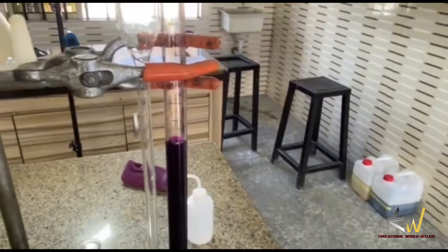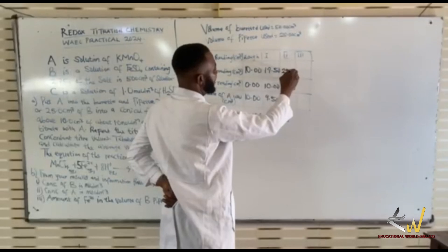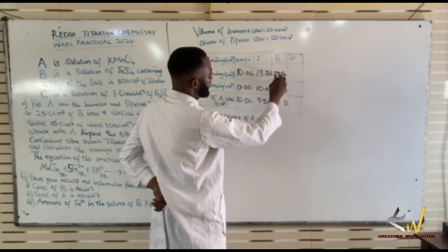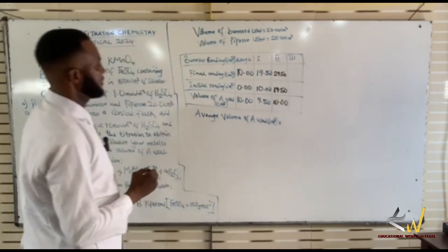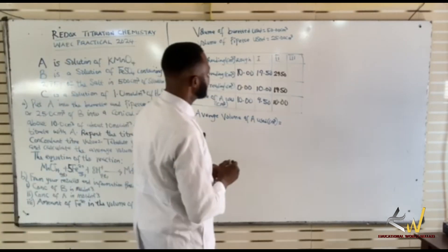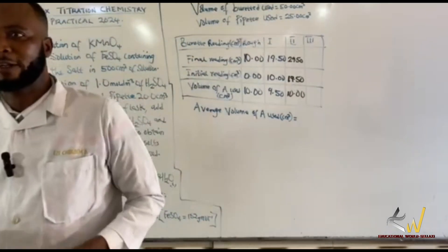This is 29.50. I started from 19.50 and now I'm having 29.50, so the difference is 10. So we have 10. It's not concordant — we have to do another one. It's not concordant, so I have to refill.